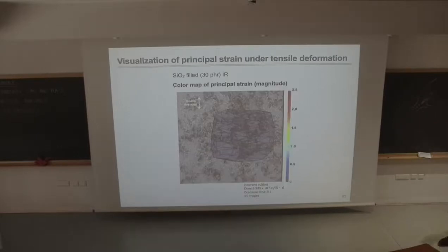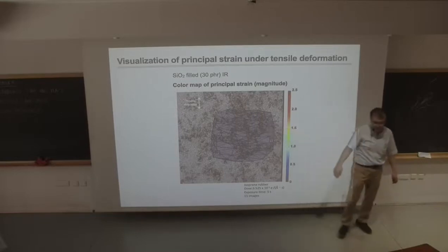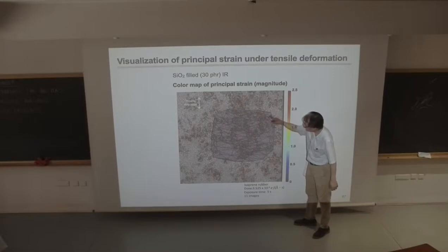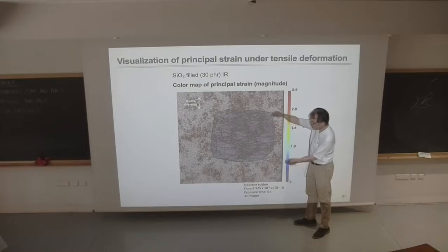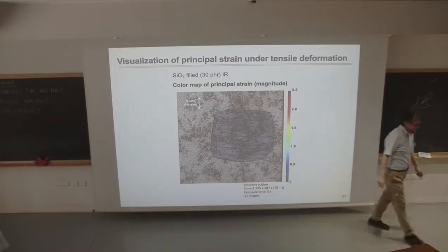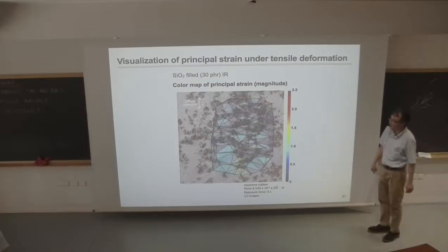So we do this kind of analysis for this stretching experiment. We can have these tiny triangles. We make that, and then a poor student follows this position as a stretching. He finds the same position at a different strain, and then calculates the local strain.